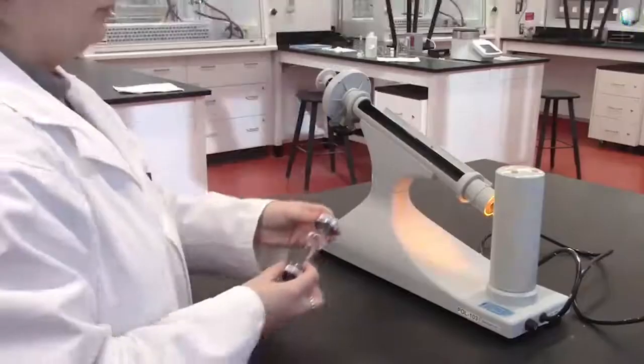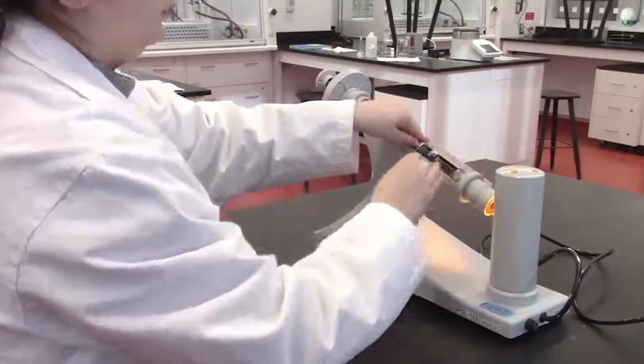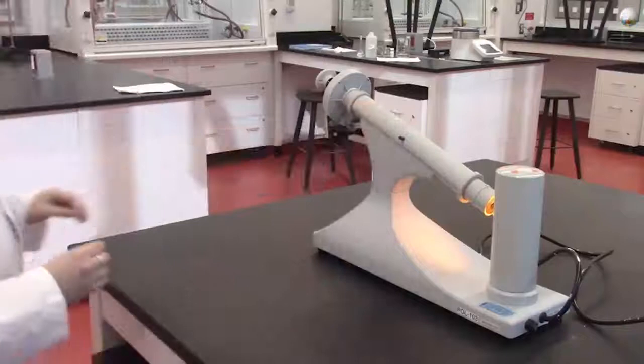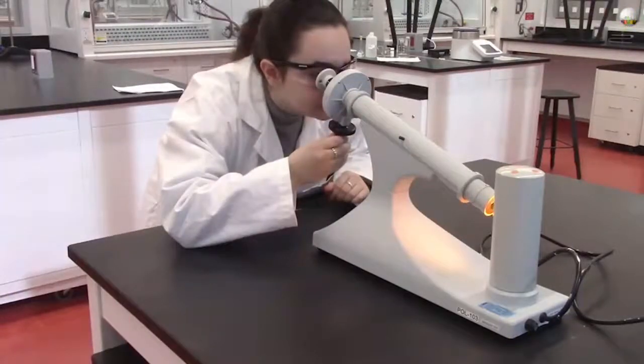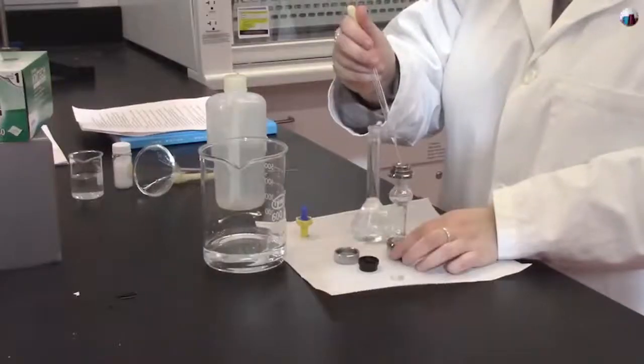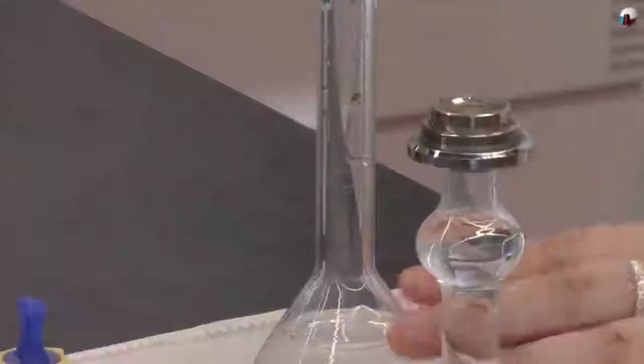Next, open the hatch to place the sample holder. Close the hatch and observe through the eyepiece. To ensure calibration, make sure the two semicircular halves are of equal brightness. Make sure that the inner and outer scales have their zeros aligned. If not, align them by moving the inner scale. This implies that the machine is calibrated.